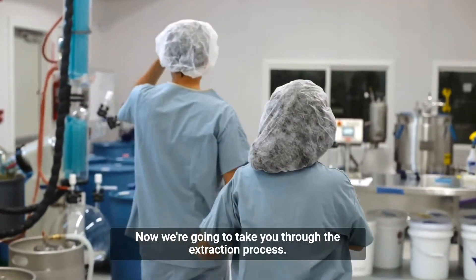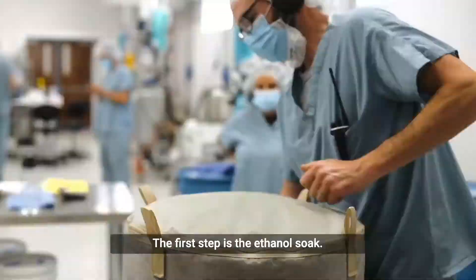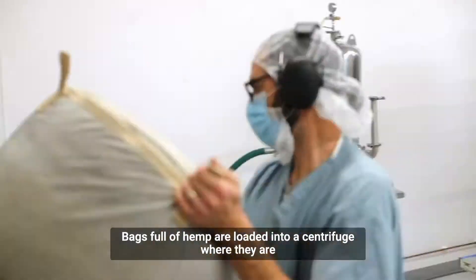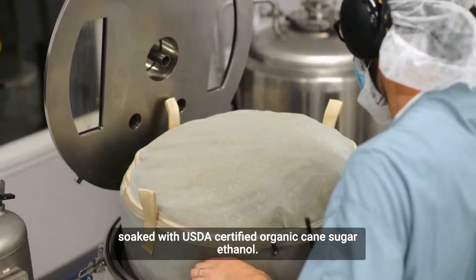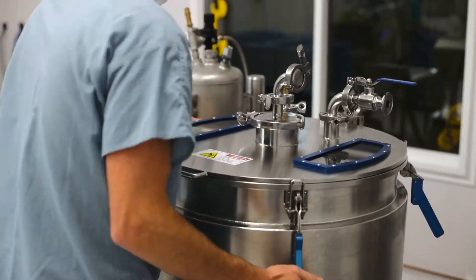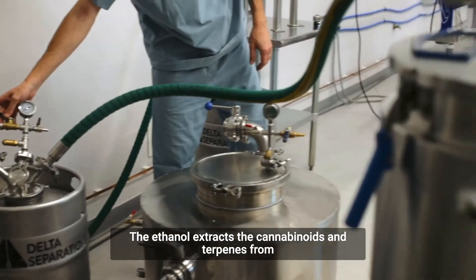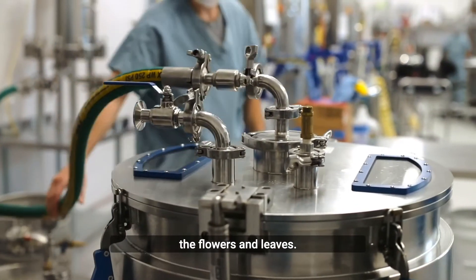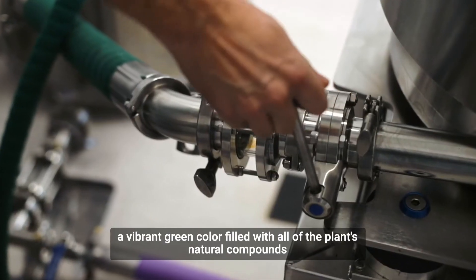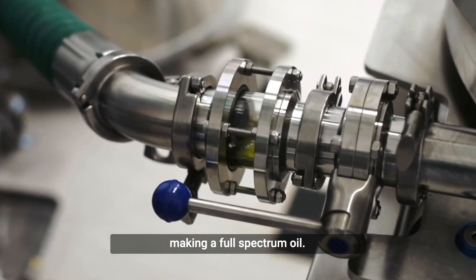Now we're going to take you through the extraction process. The first step is the ethanol soak. Bags full of hemp are loaded into a centrifuge where they are soaked with USDA certified organic cane sugar ethanol. The ethanol extracts the cannabinoids and terpenes from the flowers and leaves. After soaking, the ethanol becomes a vibrant green color filled with all of the plant's natural compounds, making a full spectrum oil.